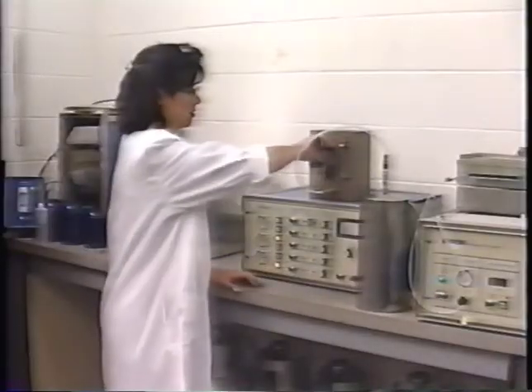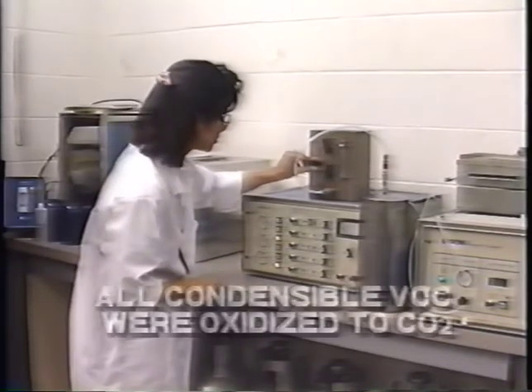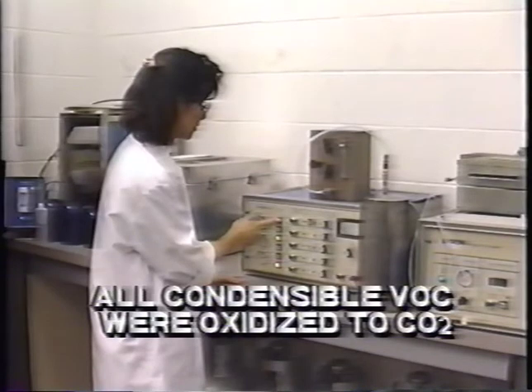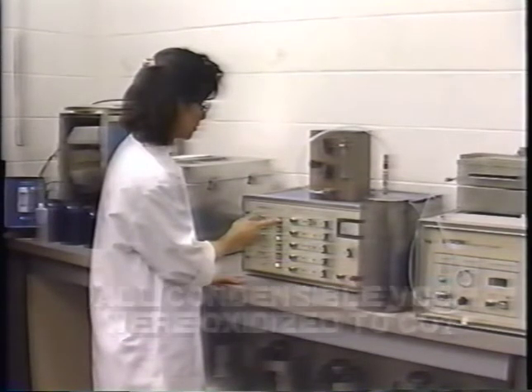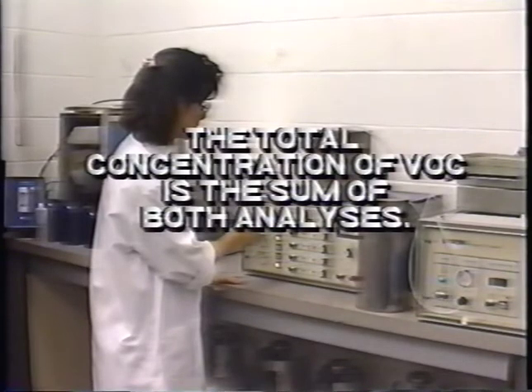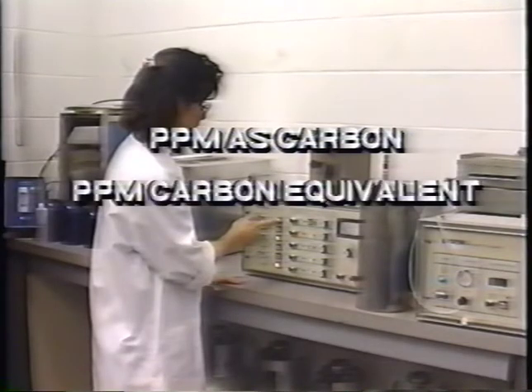The sample from the second tank is analyzed in a similar manner with one difference. Remember, all of the condensable VOC were oxidized to CO2 and collected in this tank. Therefore, the CO2 peak from this tank should be measured and counted as VOC. The total concentration of VOC is the sum of both analyses. The units are parts per million as carbon, or parts per million carbon equivalent.